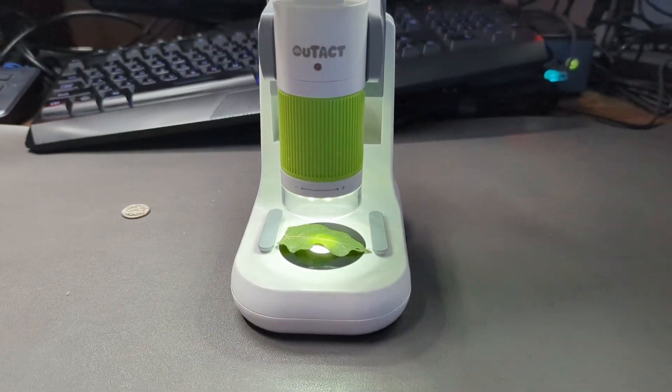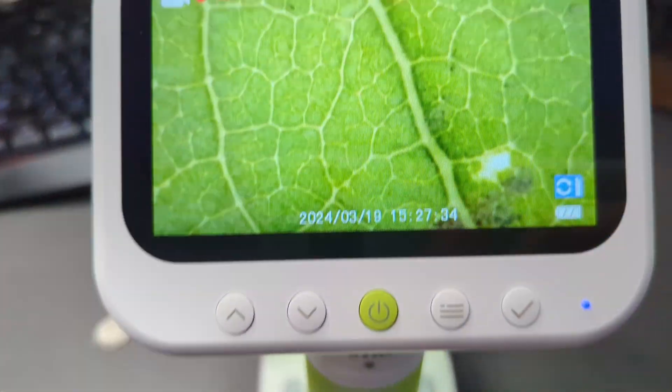You can take pictures or record from here. This thing is so much fun. This was sent to me so I can make this video. Let me show you what you get and how to navigate the menu.